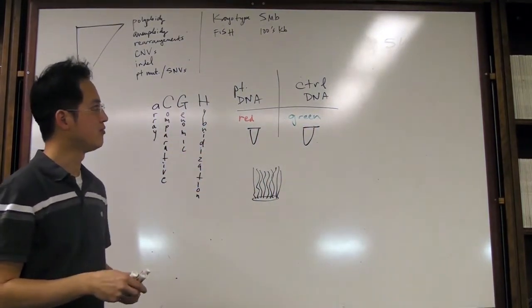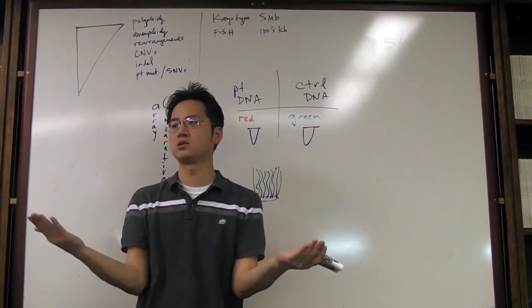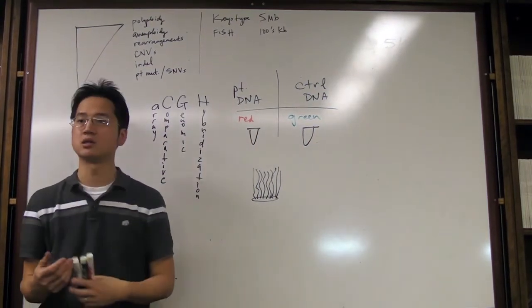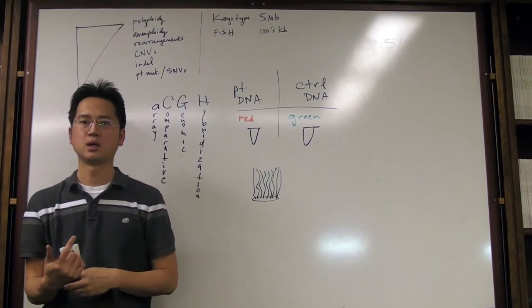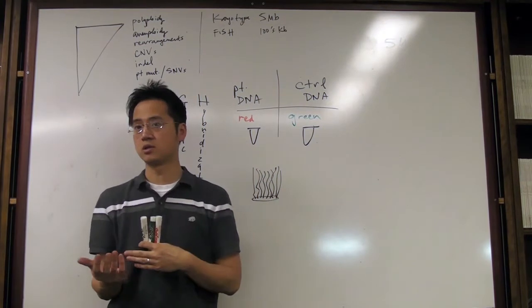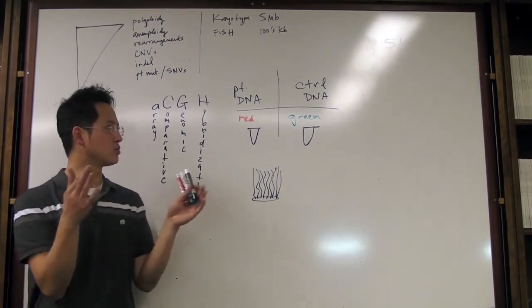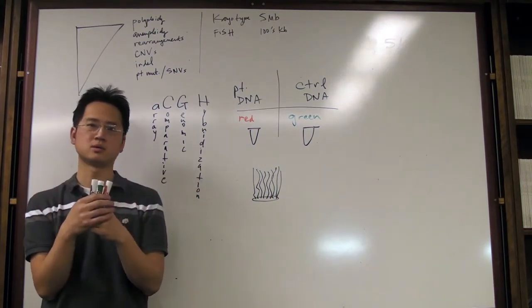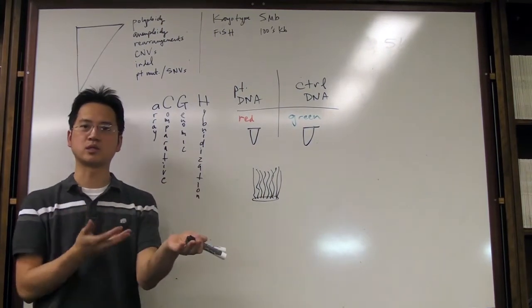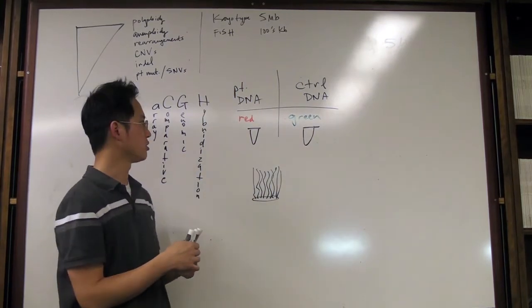So up front of this, some folks like to do some shearing because shearing helps the DNA denature during this process. So you might use enzymes, for example. Agilent recommends using 2 enzymes, AluI and RsaI. And I'll get into a bit why that's needed later. You can also do mechanical shearing, so if you did sonication, sort of a non-specific way of shearing the DNA, you could cut it down to maybe 200 base pairs, 300 base pairs, maybe 150 will work as well. And then after that, allow those to melt, serve as template for the random prime labeling to label the patient DNA or the control DNA, red or green respectively.